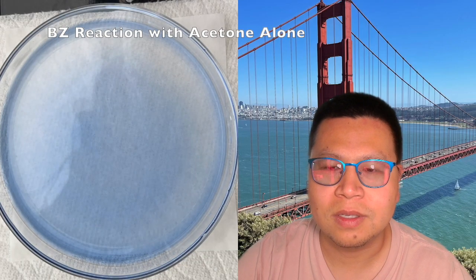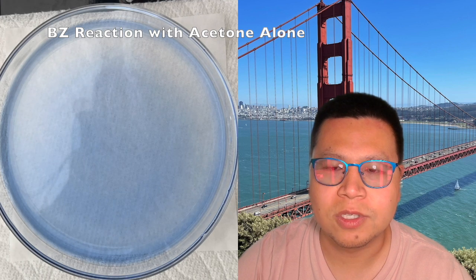I have prepared a petri dish with 7 ml of solution A, around 0.2 ml of acetone, 0.5 ml of solution C, and 1 ml of solution D. This is the same recipe used for previous petri dish experiments in this channel, except that malonic acid was replaced by an arbitrary amount of acetone. You are now witnessing its reaction in a time-lapse video. Despite my best efforts, no visual change was observed.